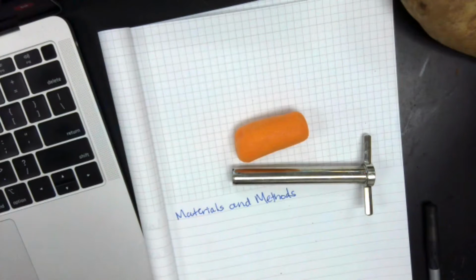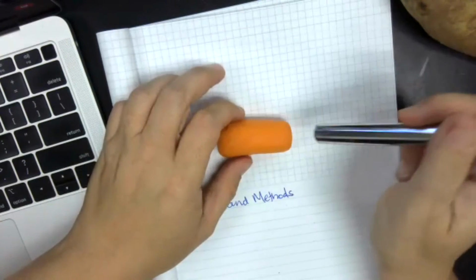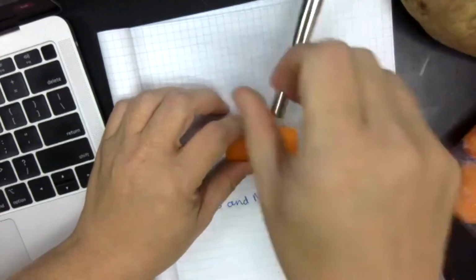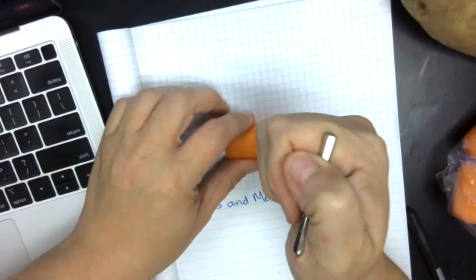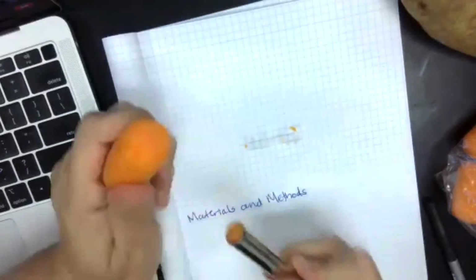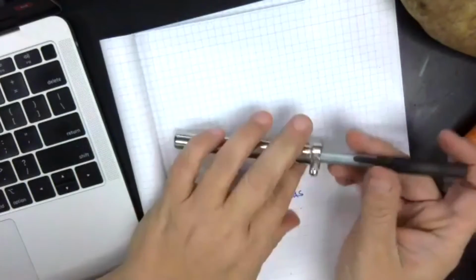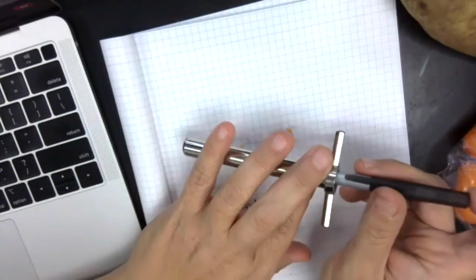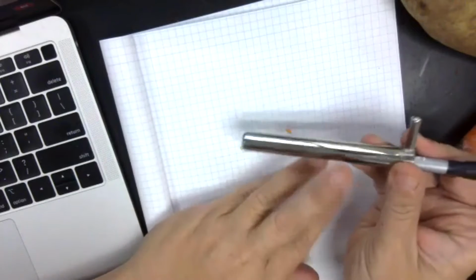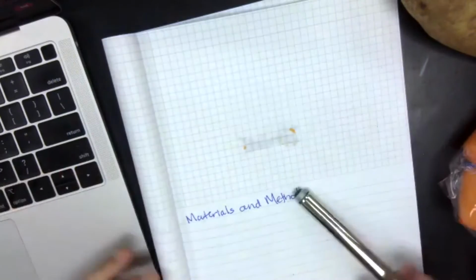So the carrot is tiny. Maybe I should have gotten baby carrots, but I gave you enough in there. Then you're going to use this to make a core out of each. You need a total of 6 cores. You're going to poke it through there. Be careful because it is sharp. It's cutting the vegetable. Then you take your needle, not the needle side, but the wooden side or the white side of it, and you're going to pop out your core.